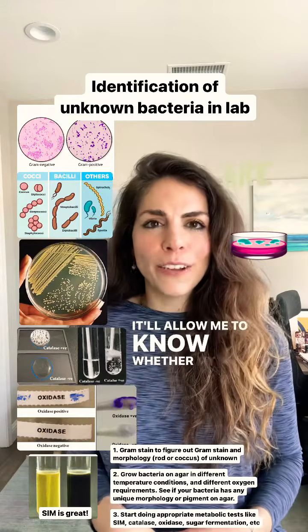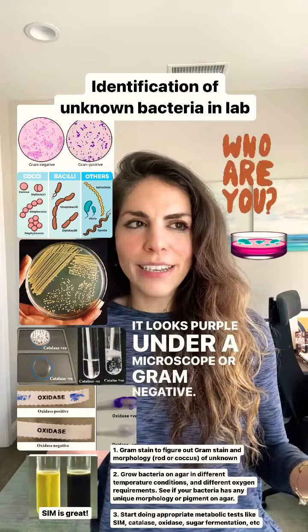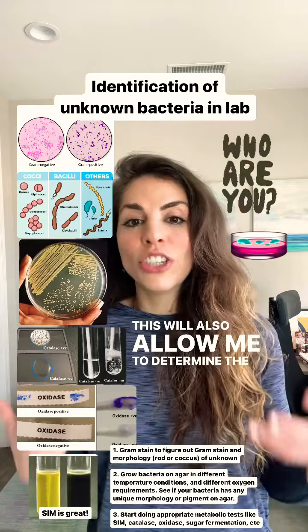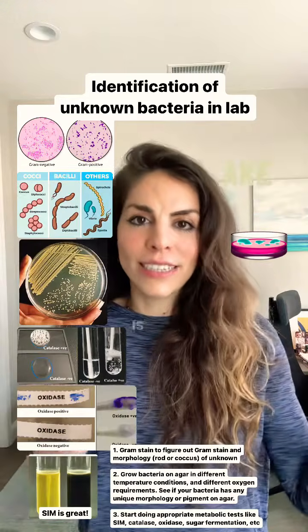It'll allow me to know whether my unknown is gram positive, it looks purple under a microscope, or gram negative, it's reddish pink under a microscope. This will also allow me to determine the shape, the morphology of my bacteria. So is it rod, is it coccus, is it spiral?